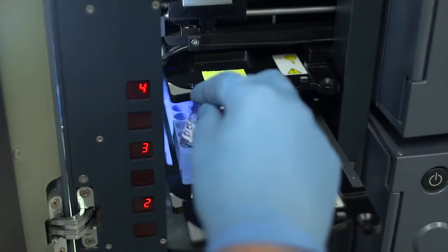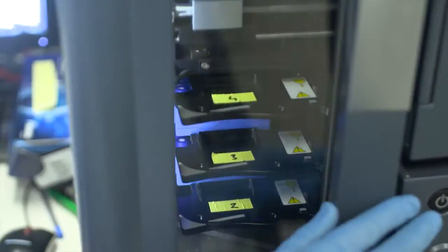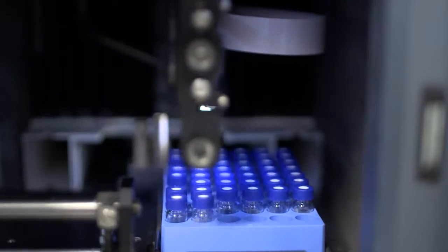We use the Waters G2 Quadrupole Time of Flight and the XIVO TQ-XS that is virtually brand new for allergen protein research.